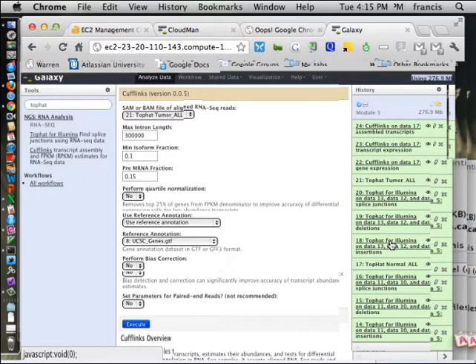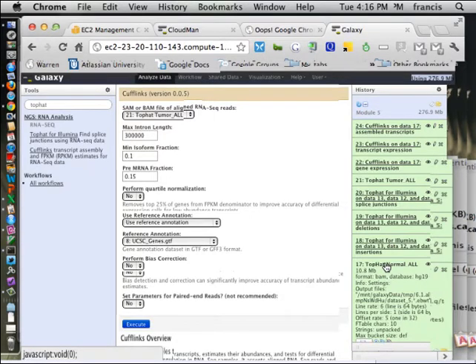Actually, if you explain the steps in the pipeline. Sure. So once you have run TopHat, you will obtain four different files. You'll see one that is called accepted_hits.bam. So this is a BAM file of just a mapping of the reads to the genome. You have the insertion, the deletion, and the splice junction files, which makes four files for the tumor and four files for the normal.